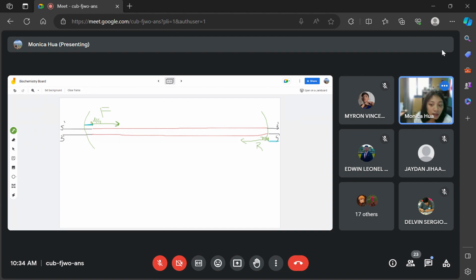But before those start and stop codons, you can code for the restriction enzyme site at the beginning of your forward and your reverse primer. So right now, that's what we're going to do. We are going to create the primers that will help us in PCR to take out this sequence.